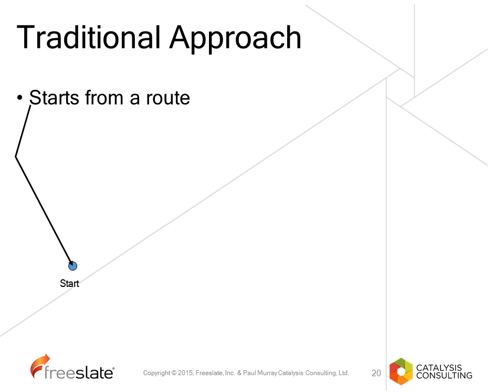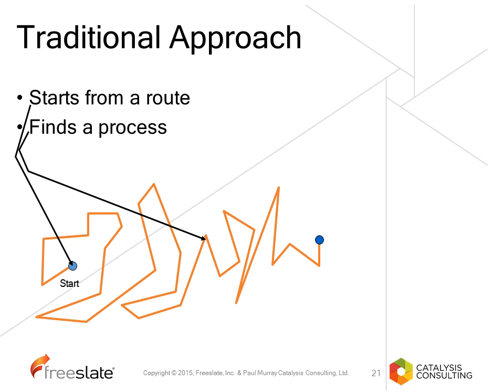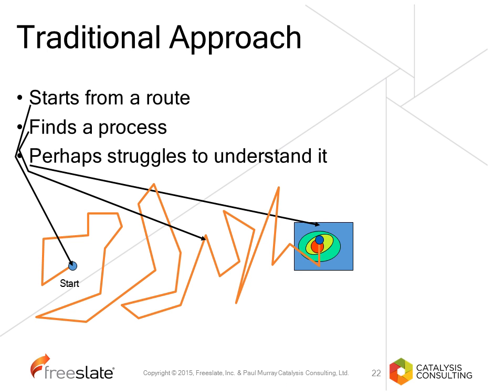If we look at it from a development from a chemistry point of view, you have an idea of what you want to do. You have chemistry you want to do. You start with an experiment. We carry out large numbers of experiments, moving in different directions, changing one factor at a time, trying to get the reaction to work more effectively. So we follow a long route, changing many things to try and get something that works. We find something that works, and then we try to understand it. And this is how people are traditionally trained, changing one parameter at a time.